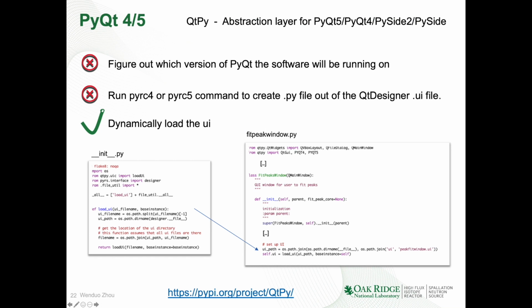In our early development, back to 5 or 6 years ago, we used PyQt 4. Then we started to use PyQt 5. One major issue that we encountered was that for all the workstations in our analysis cluster, they are heterogeneous to support PyQt 4 or 5. Thus we end up like this to import the right version of PyQt. Of course, this is a pretty bad solution.